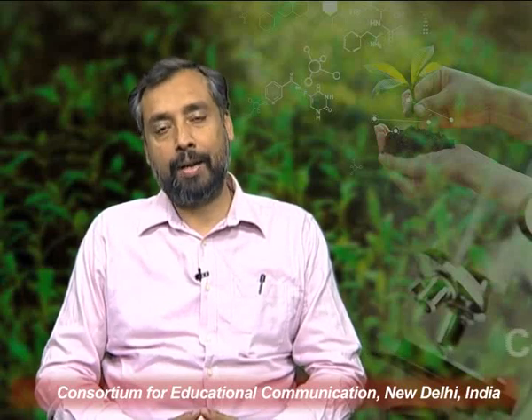We also understood various different types of light microscope and stereo microscopes. We proceed now towards a more advanced and more efficient modification of microscope, that is fluorescence microscope.